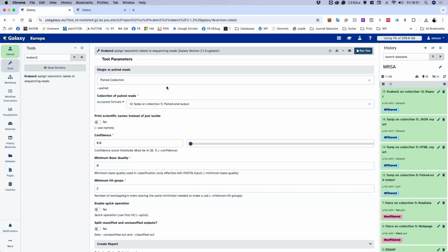So what is about the third question? I don't understand taxonomy. Is it from the same file or from others? No, because if you remember, whatever number you're getting corresponds to a species, right? So what you do is type the number you're getting and search it inside the NCBI taxonomy database.